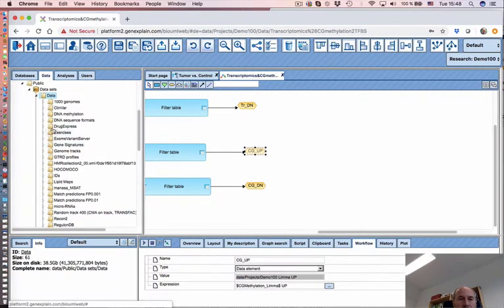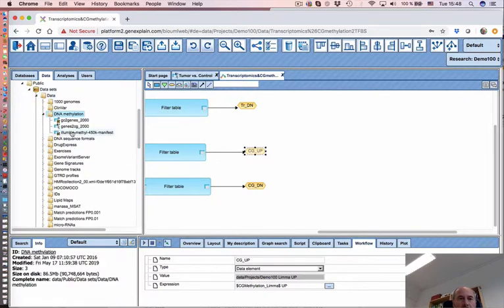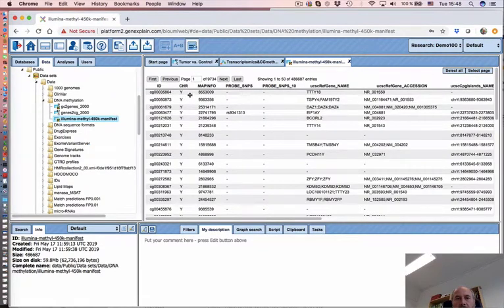So we have here for the DNA methylation this table which contains the coordinates in the map info for each of the CG accession numbers. So we have to annotate our table with this information about the chromosome and the position in the chromosome. The only thing you have to take into account is that these are the coordinates for the human genome build HG19.